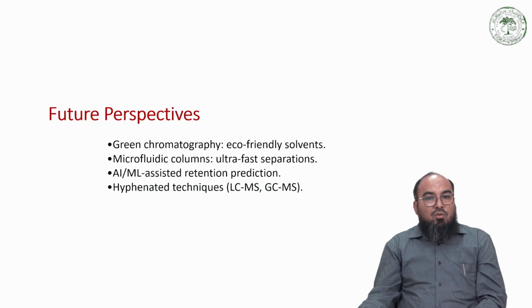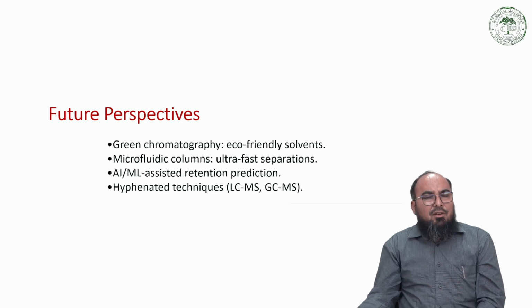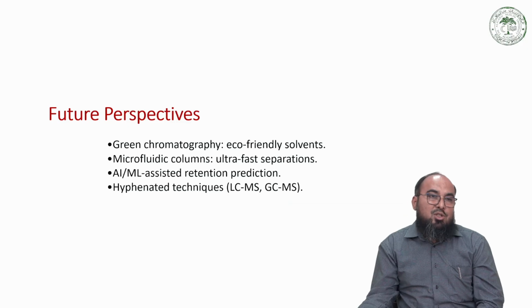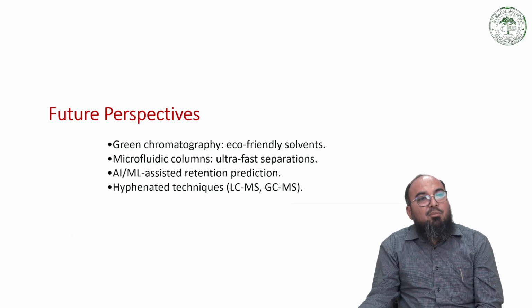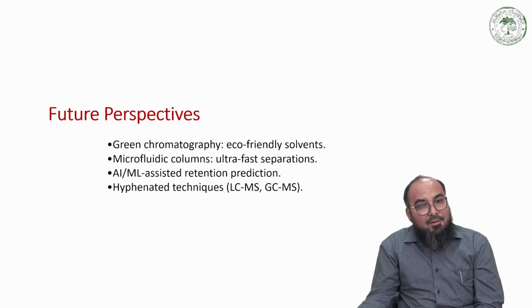So what are the future perspectives? Nowadays, we are more concerned with the environment. So we have some eco-friendly solvents. We do not have to use very toxic solvents every time. Most of the time we have to rely on eco-friendly ones. And the most eco-friendly solvent is, of course, our delicious water. But water is actually making problems because it is very polar. So we have to optimize in terms of green solvents.